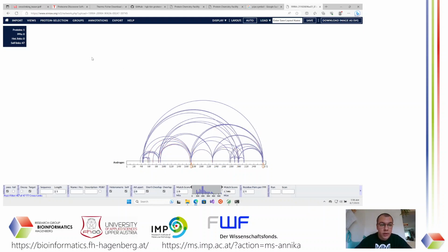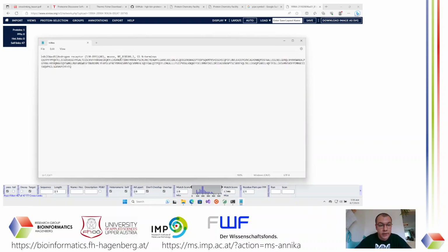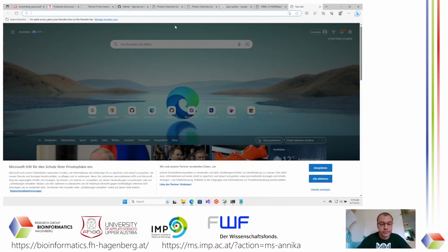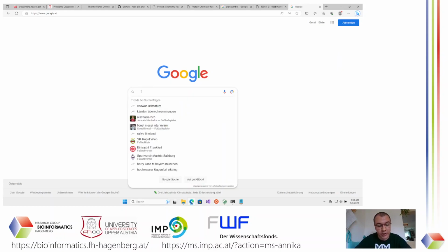Another thing that you can do is upload a PDB file to visualize this in a 3D structure. In this case, we have to find the specific PDB file first. So I'm going to look at our fasta file. We have some identifier in here that we can Google. Usually you already know about the proteins that you're analyzing beforehand, so you can look them up on the PDB. In this case, I got these raw files without very much information, so I'm just going to have to make use of the information that I have.